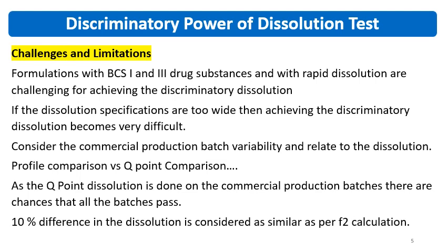Another one is if the dissolution specifications are too wide, then achieving discriminatory dissolution becomes very difficult.